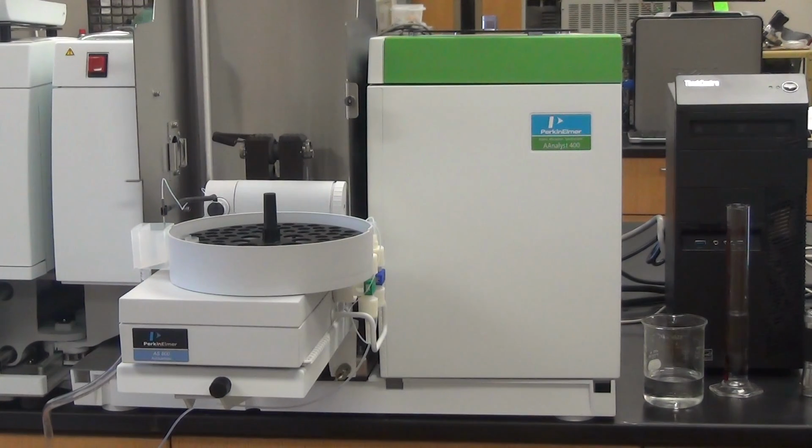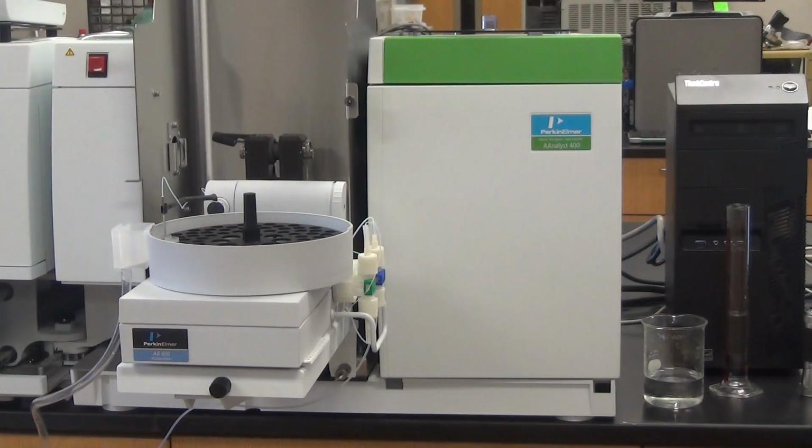So when you invent stuff like that, they name it after you. And then align the tip again. It says set the depth in the sampling cup. Use the cup or a rinse location. So this is setting how far we're going to go into the sample. And now we click on finish and it will save that position.